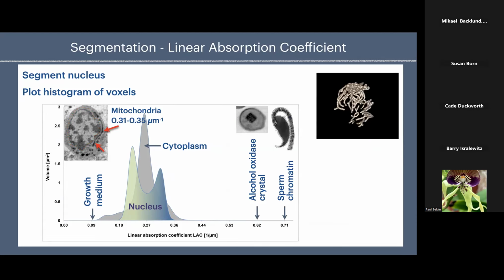Your mitochondrial network in a human cell. And you see how, it's really a beautiful network of mitochondria. You can now get volumetric measurements and spatial distribution measurements, et cetera.